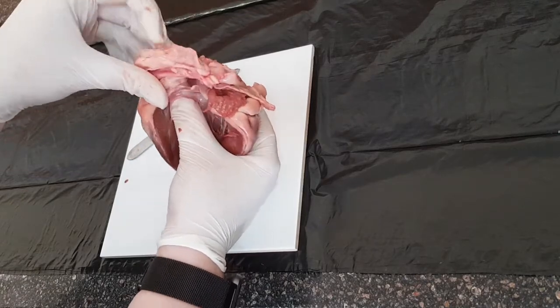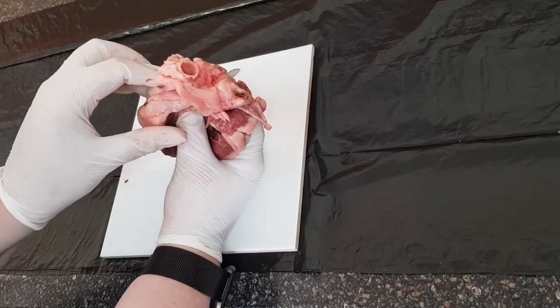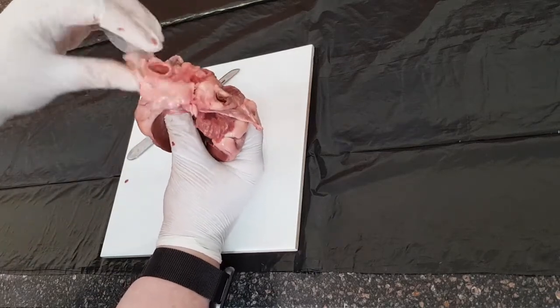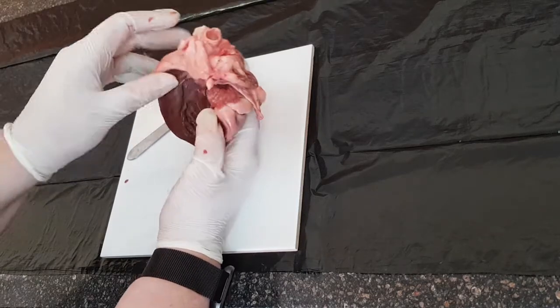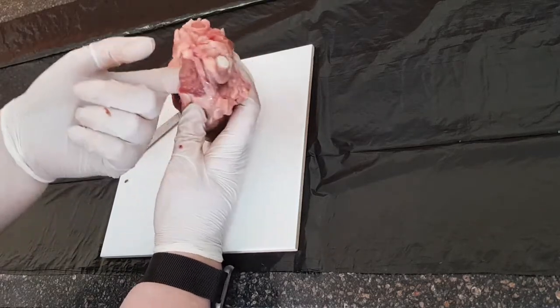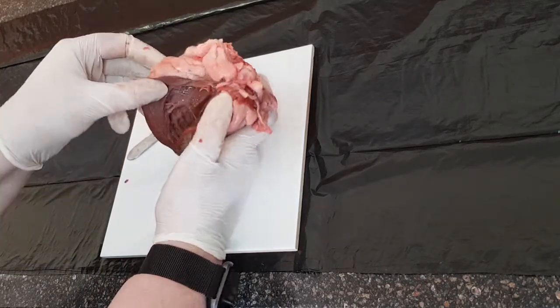I'm going in from one side. And since there's two going into the same chamber, it means it probably comes from or to the lungs, because remember there's the left and the right side. And then on the other side, we would have our other blood vessels going in.